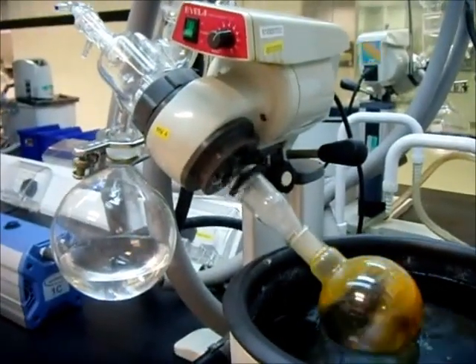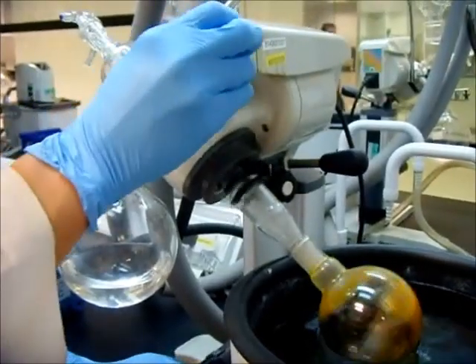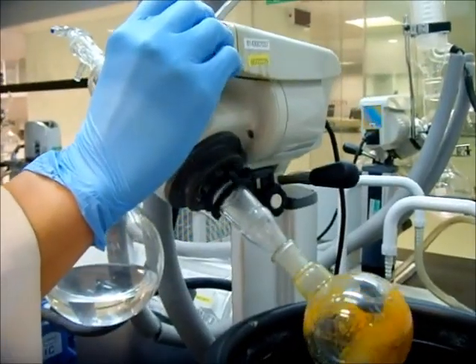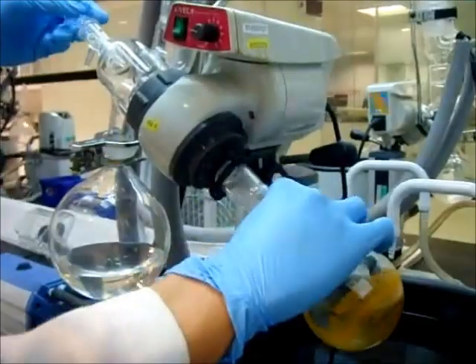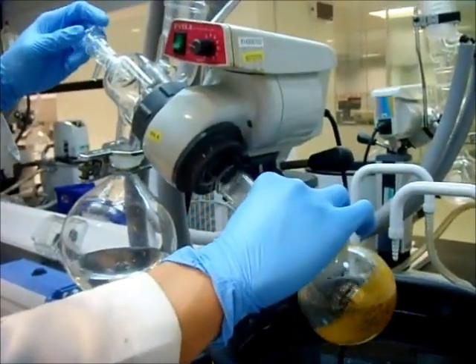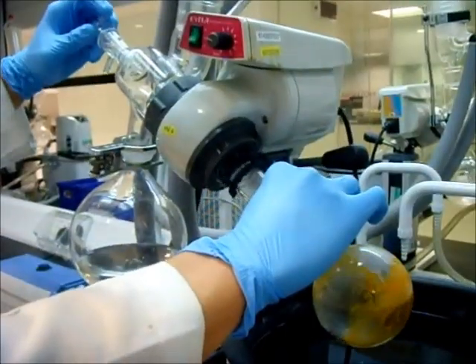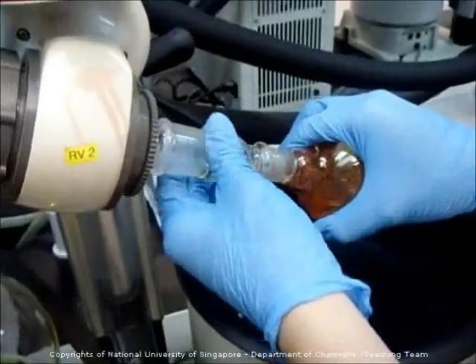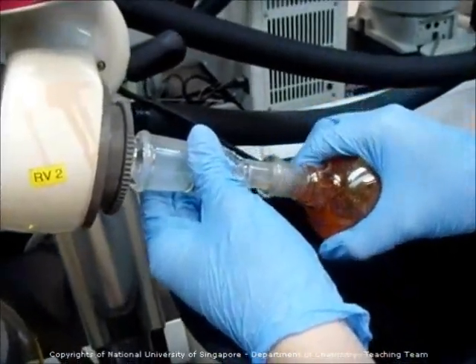After some time, you will notice that there are no more solvents inside the round bottom flask. Turn and lift up the lever. Adjust the rotation speed to the lowest. With your right hand holding the round bottom flask, use your left hand to slowly and gently turn off the vacuum. Switch off the aspirator, and using both hands, slowly rotate the round bottom flask out of the adapter.